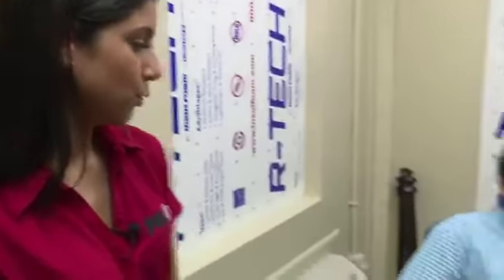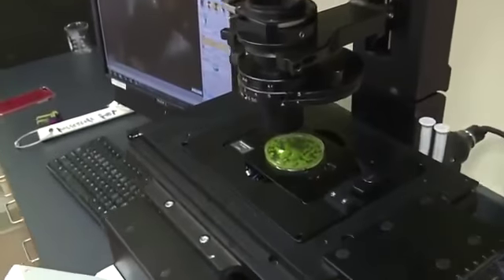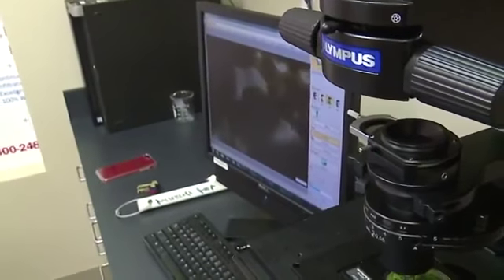Gotcha. Okay. Well, we'll talk a little bit more about that, and our story's going to air at 6, so we'll talk about solutions, what people can do. But for now, one last overview of what we've been doing. We grabbed a sample from the Coral Pointe Canal in Cape Coral. We brought it to FGCU's Vester Field Station in Bonita Springs and put it under a microscope with Dr. Parsons here. We're going to talk a little more about it later.